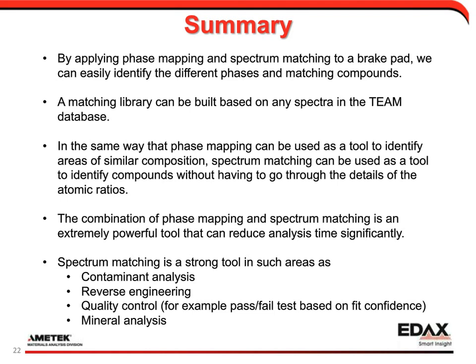We're also seeing some use in reverse engineering, where you take a competitor sample and try to figure out what did they do and what did they put in here. Quality control as well. You could go through and compare all your quant numbers and look at how much they deviate, but the spectrum match can be used as a quick pass-fail test on your fit confidence, basically.